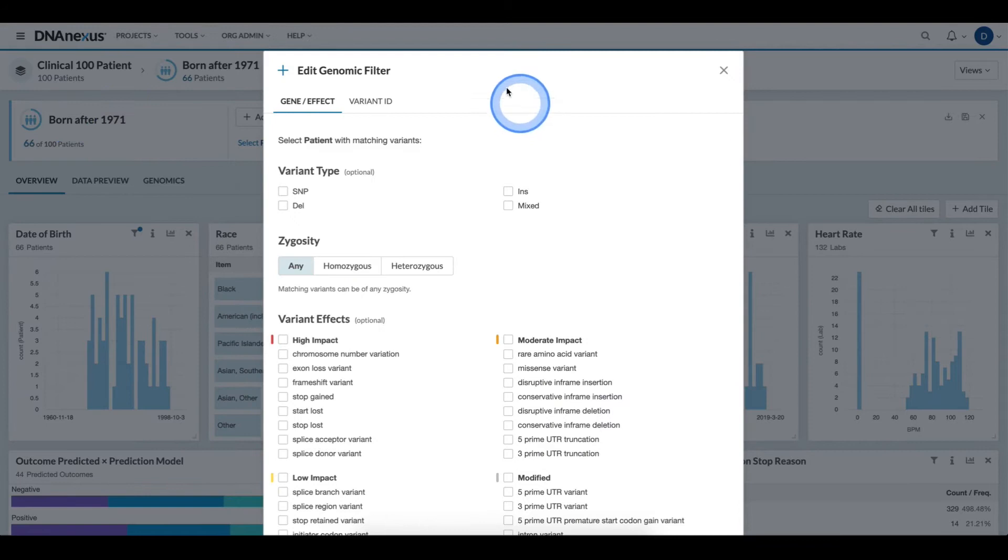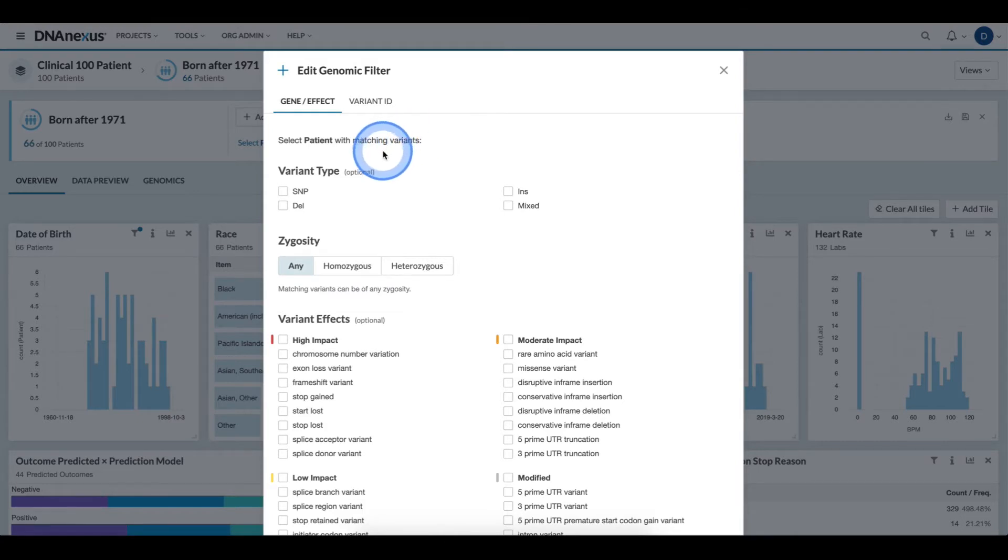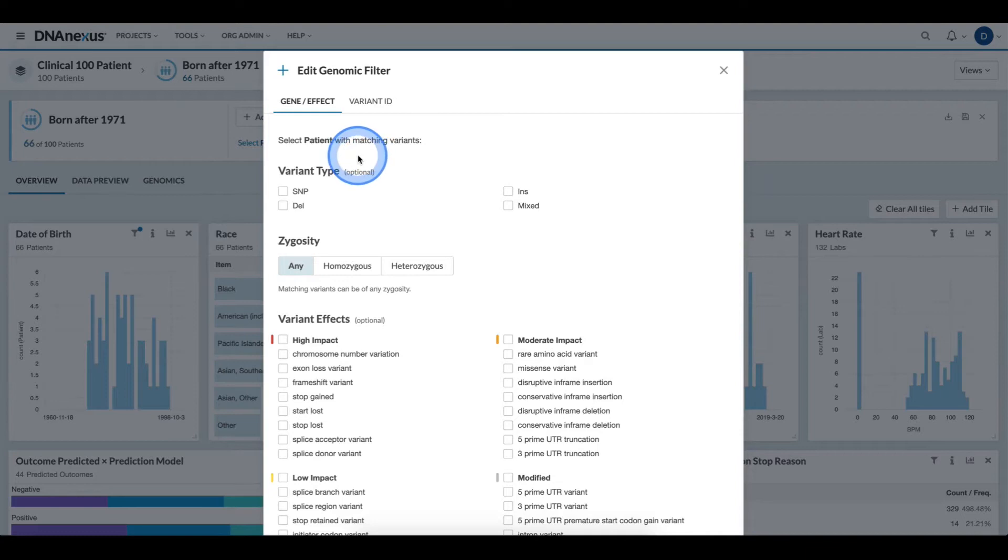This brings up a filter modal that allows me to specify a genomic-based filter. In this case, I want to filter for all individuals that are homozygous for a high or moderate impact variant in BRCA1.